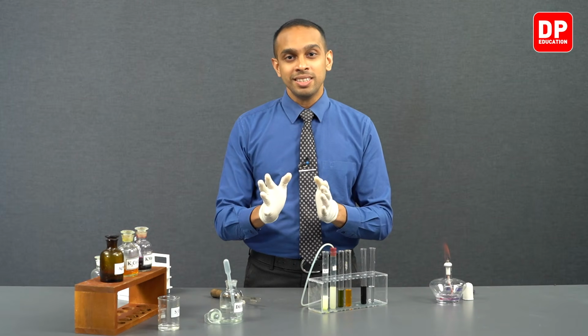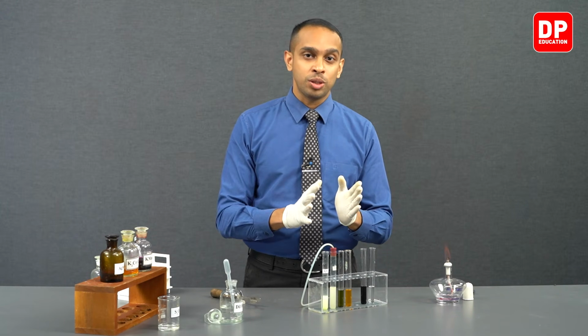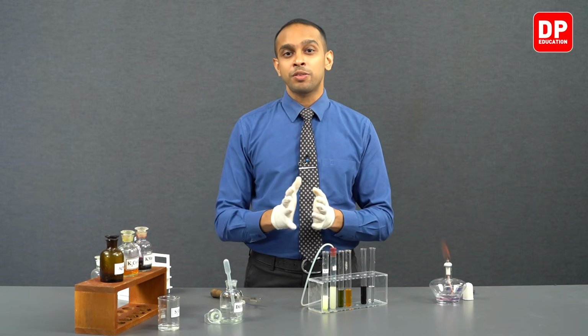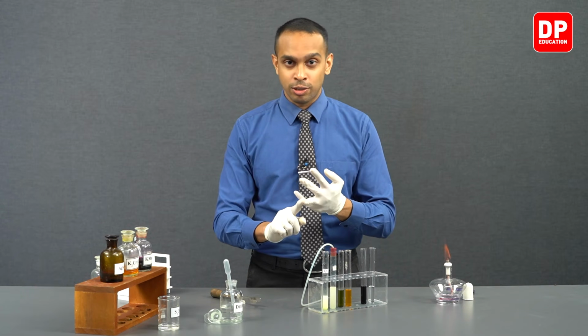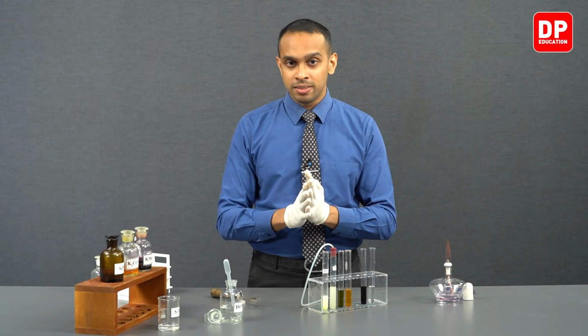So, when you add hydrochloric acid to an aqueous solution of thiosulfate ions, they will react with hydrochloric acid to form sulfur, or solid sulfur, and sulfur dioxide. Sulfur solid will be formed in the form of colloidal sulfur.